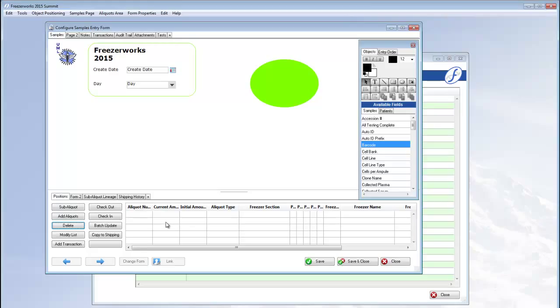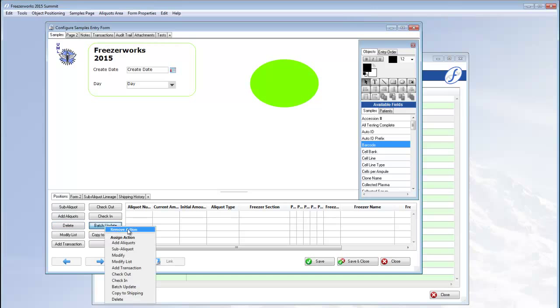What a user can do with aliquots on an entry form is entirely up to this configuration. Thank you, and until next time.